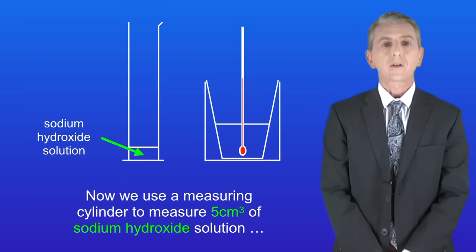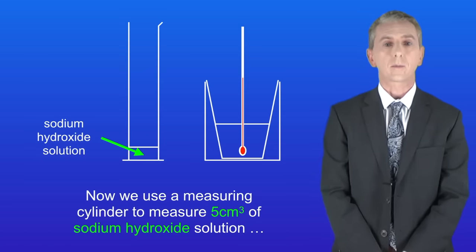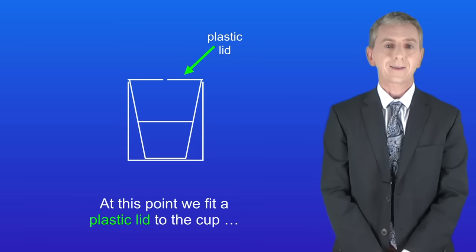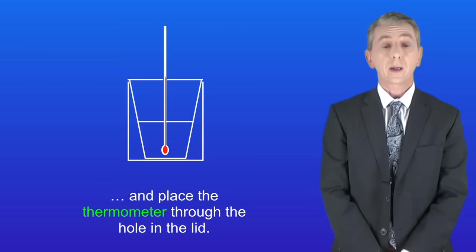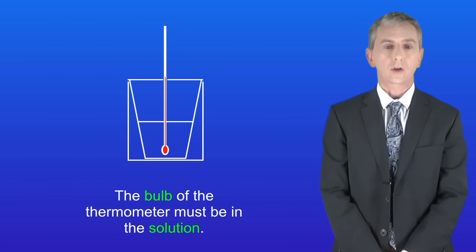Now we use a measuring cylinder to measure five centimeters cubed of sodium hydroxide solution and we transfer this to the polystyrene cup. At this point we fit a plastic lid to the cup and place the thermometer through the hole in the lid and the bulb of the thermometer must be in the solution.